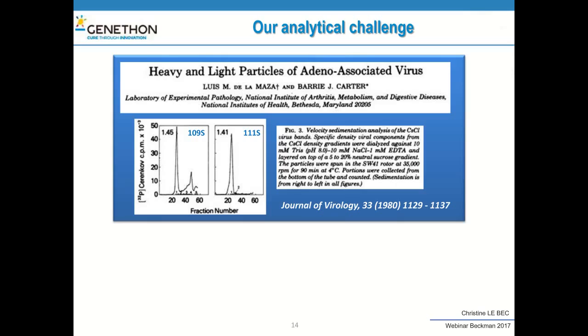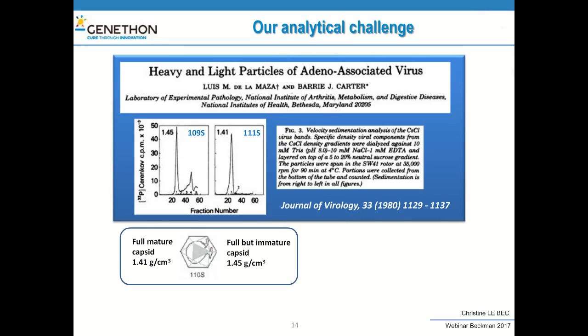At the beginning, we based our work on what was published in 1980. We know that for AAV you have heavy and light particles, full and empty.